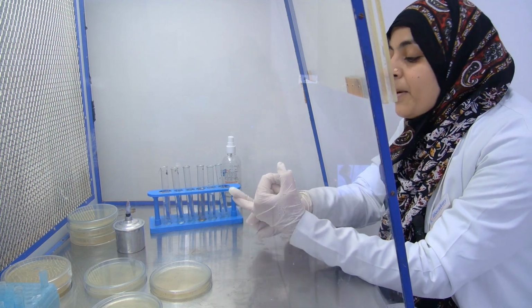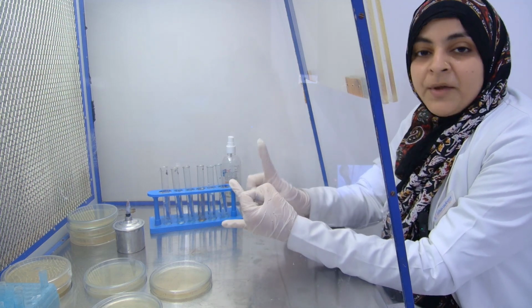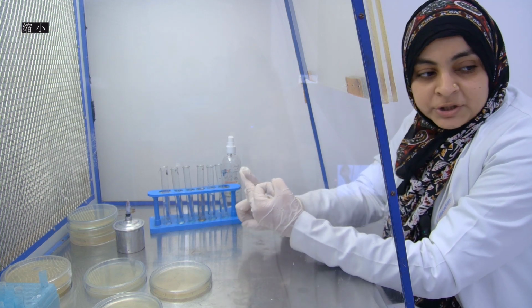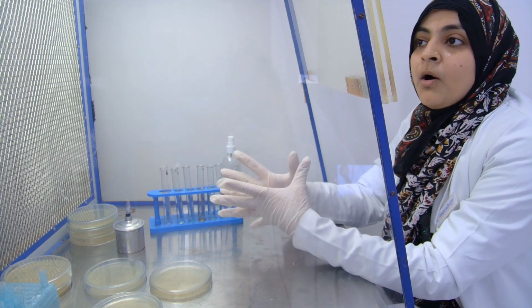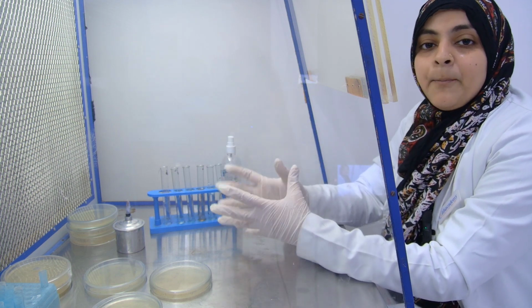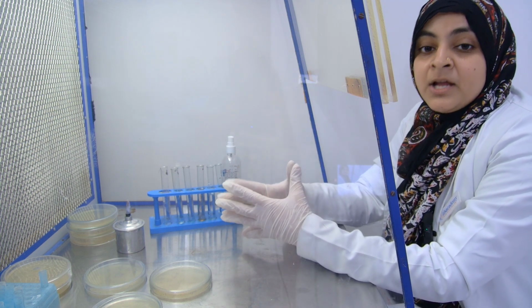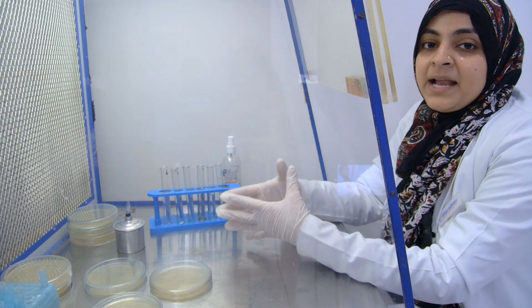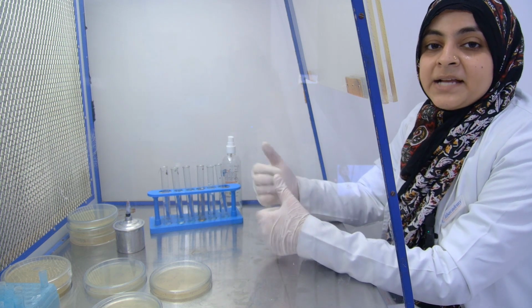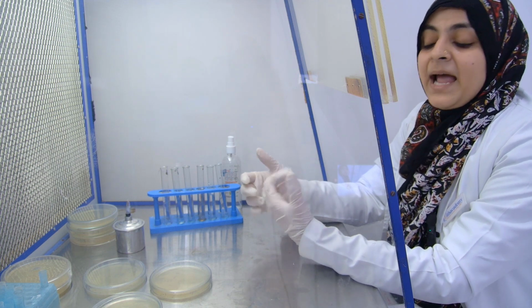How we prepare the media, how we sterilize the media, how we do a serial dilution, and how we maintain the pH, these videos are already uploaded on our YouTube channel. You can visit our YouTube channel and see the videos related to these topics. Then you can better understand how we perform all these experiments.